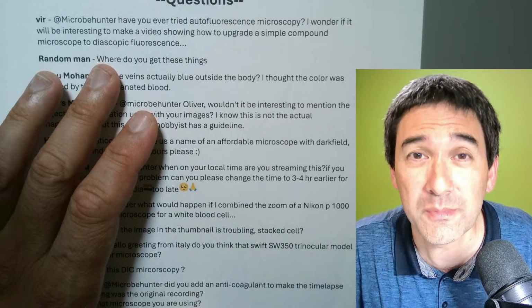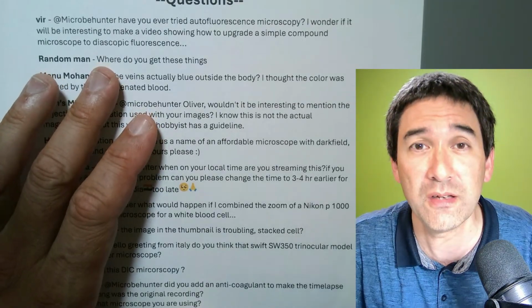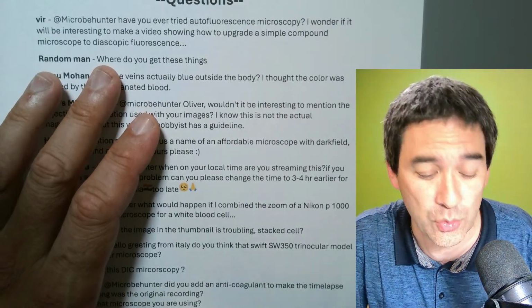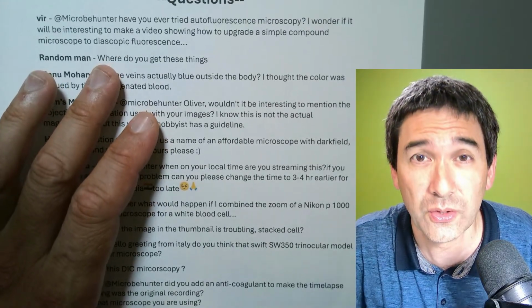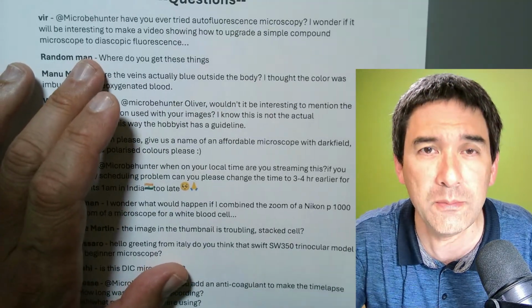So sometimes some of the slides can be quite rare, so to say, showing very rare specimens or even diseases and so on, parasites. So these slides, if you're referring to the slides, can actually be purchased.